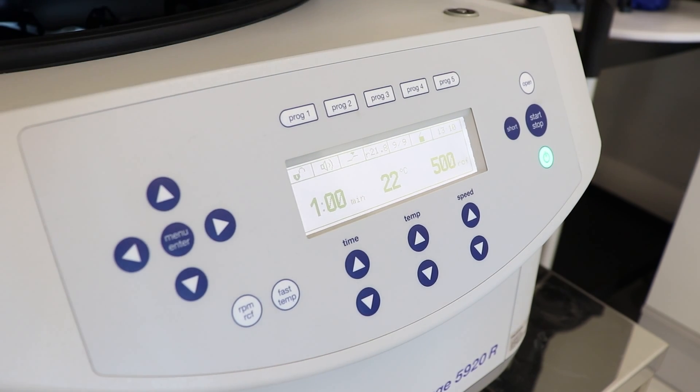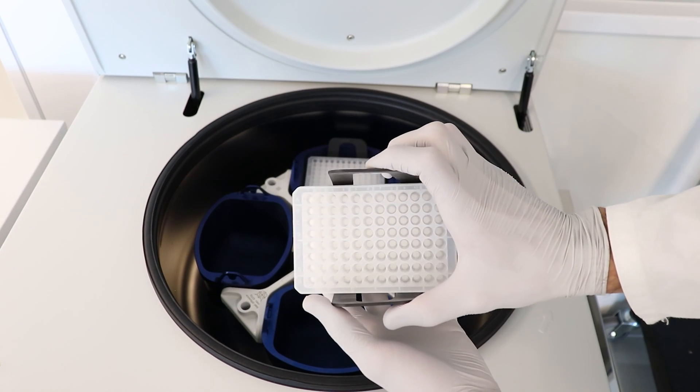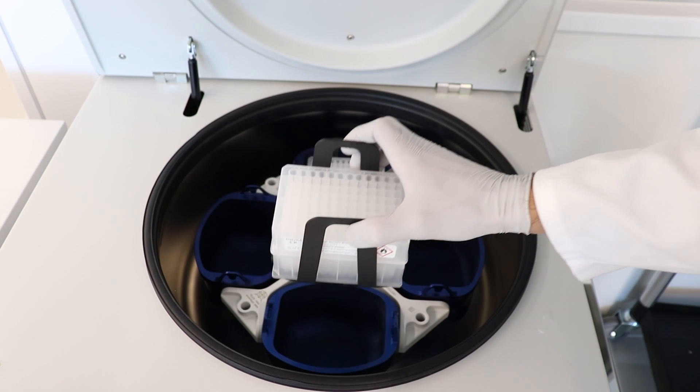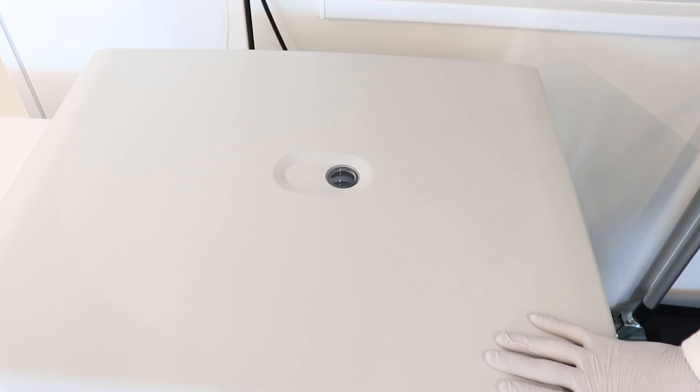The centrifuge has done its work. You can check if all the solution has passed through the well plate. If not, you can repeat the process and adjust and extend your program.